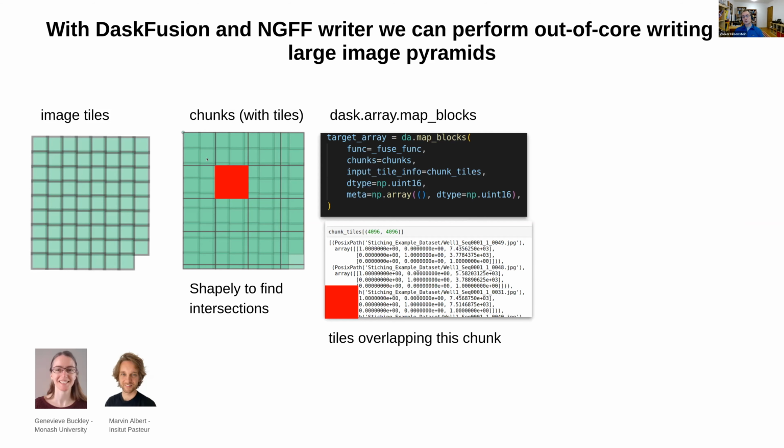And then we use map blocks, so that we have a fuse function that we define here. And basically that is called for each block. It also gets some data type from the intersection. So when a block is processed, it's sort of indexed by its coordinate.